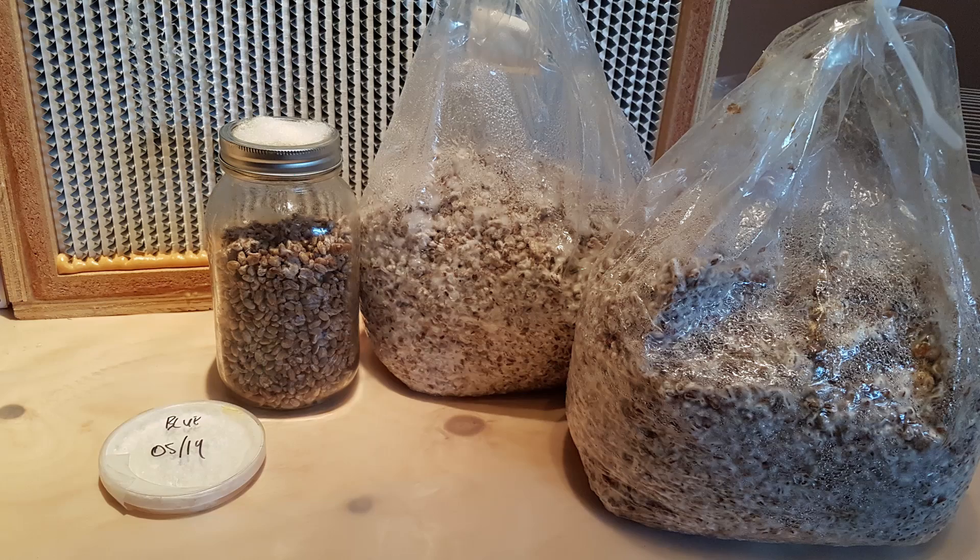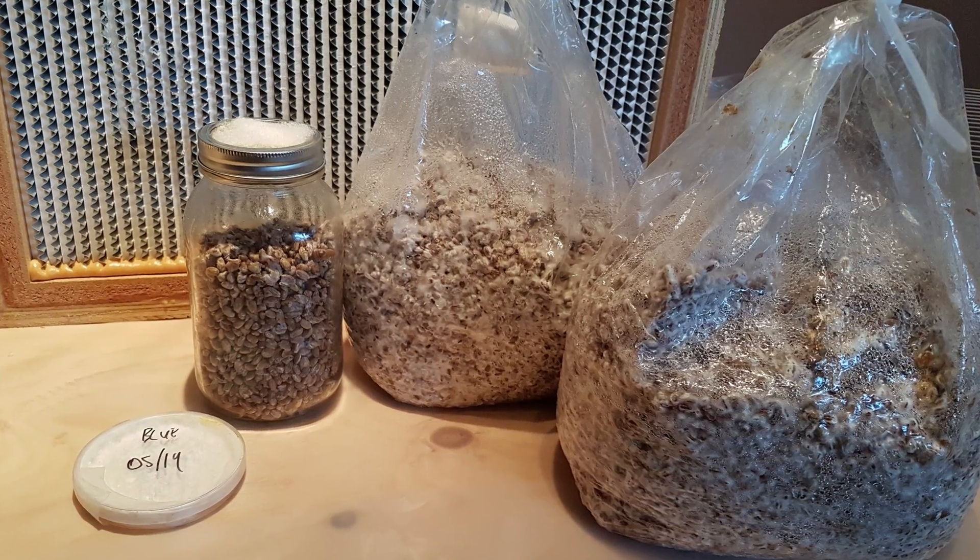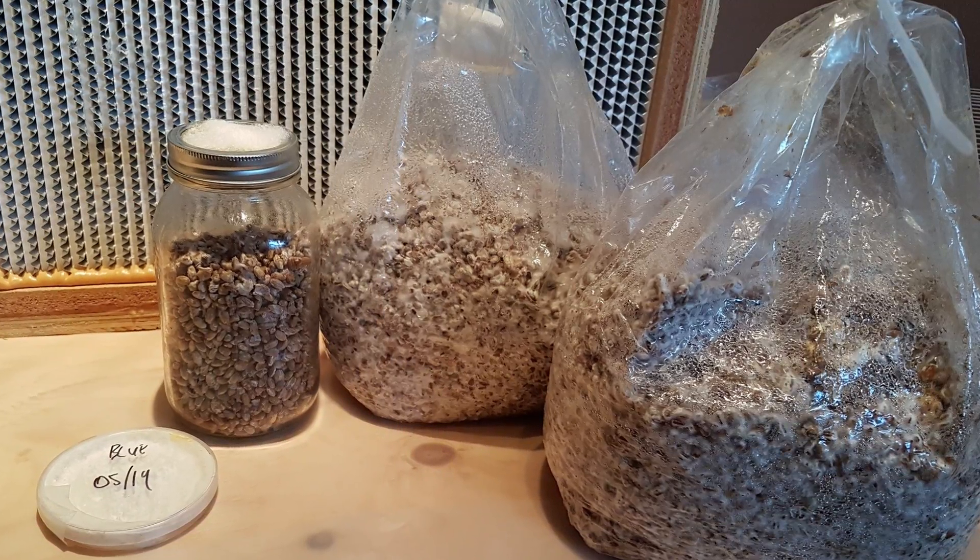Hi, I'm Tony from FreshCatMushrooms.com and today I want to show you my process for making grain spawn at home. Grain spawn is pretty much just grain — usually either rye, sorghum, millet, or a combination — that's been sterilized and then inoculated with a mushroom culture. This mushroom culture then works its way throughout the grain and fully colonizes it, and then you can use that grain spawn and add it to a bulk substrate in order to finally grow mushrooms.